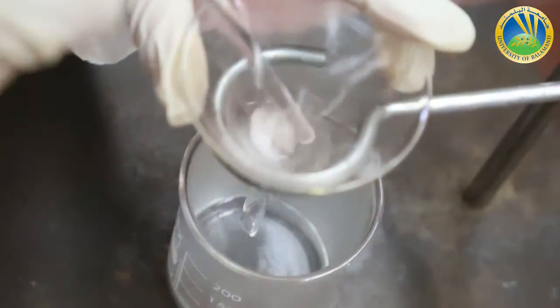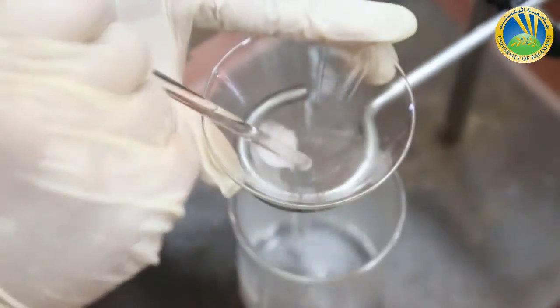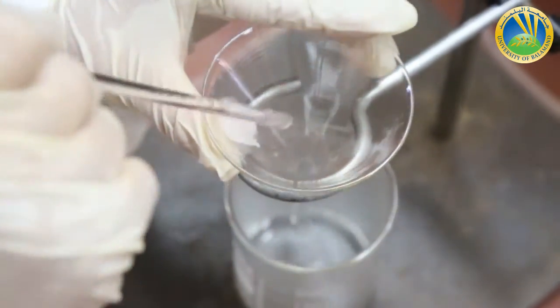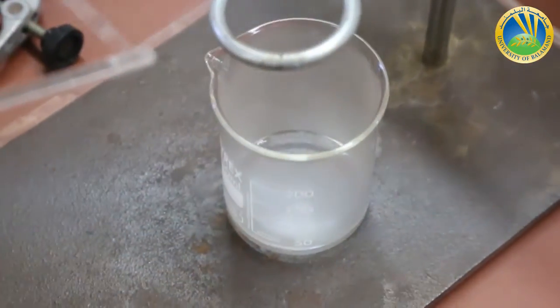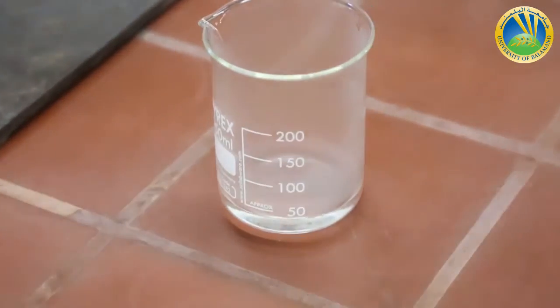Now I can press this cotton to collect all the liquid to avoid losses. Now I am done with my hot filtration. I have to leave my compound to cool down and to collect acetanilide recrystallized.